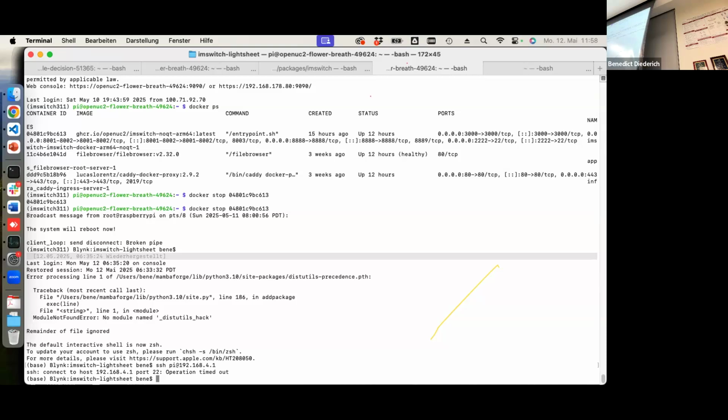Control, I have. What do you need? Just give me those. I'll read that instead. No, I prefer to go straight on. Perfectly straight on.